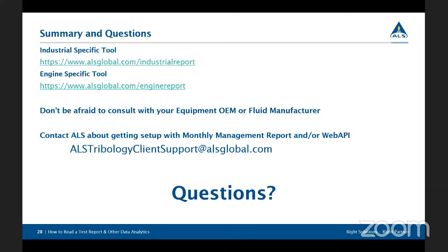Will excessive DEF fluid show up in a sample? Good question, Dave. DEF is water and urea, so what's difficult there is that we've started to look into that. I wish I had a better answer today on what we're determining is the best way to figure that out. But it is something that is coming up more and more: how to test DEF, and how to deal with DEF contamination.